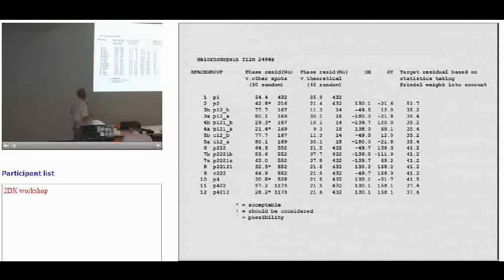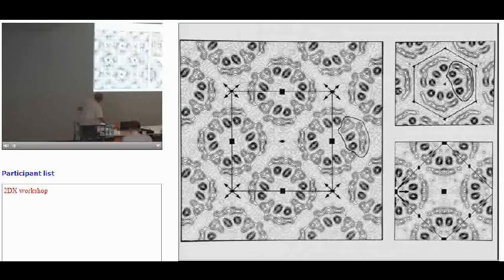Or it could be higher, or it could be only to that resolution. There are some limitations, but I think it does sort of prove it. So it gives you a reliable indicator. If you get a star here, then you've basically succeeded and you can relax. Referees shouldn't be able to criticize you, except if you indexed it wrong or left something out, and I'll show you a little bit in a moment.